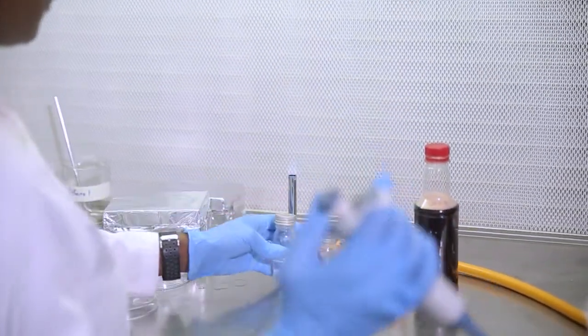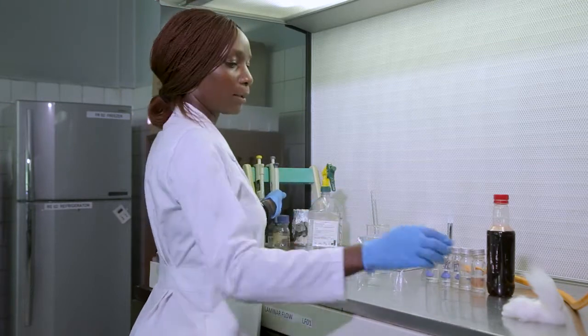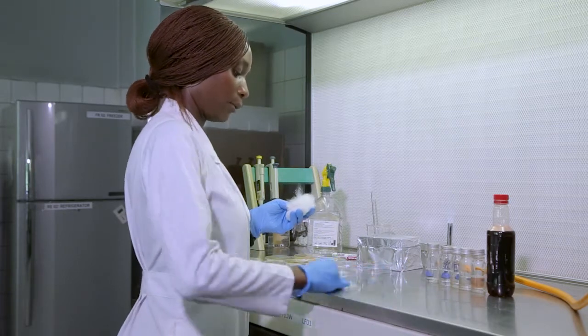Okay, so for this particular sample, I've decided to dilute up to 10 to the power negative 5 because I don't really expect it to be highly contaminated.